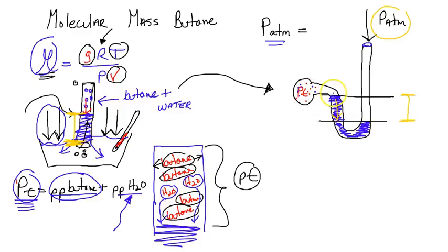So it's pushing the gas back, it's overtaking it, and on top of that, it's moving this amount of water. All right, so let's just make our numbers easy. Let's pretend this height was 10 centimeters. Well, 10 centimeters of water is not a unit. Millimeters is closer, so we're going to convert 10 centimeters into millimeters. Pretty simple. Every 1 centimeter, there's 10 millimeters. Centimeters cancel, and clearly I'm just multiplying by 10. I've got 100 millimeters of water being suspended.